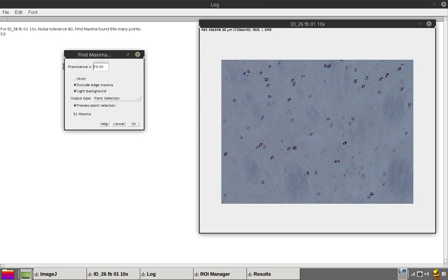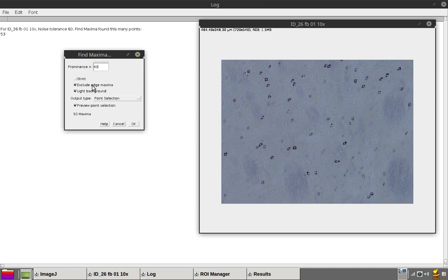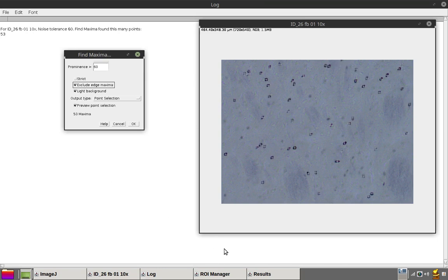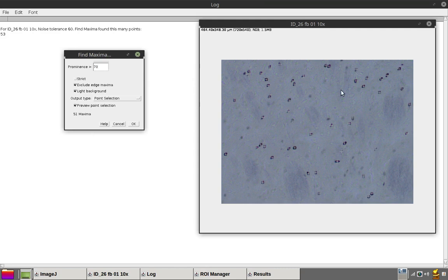Nothing at 70. At 60, you get this point here, which would be outside of our stereological criteria. Let's set it back to 70. And that looks good.